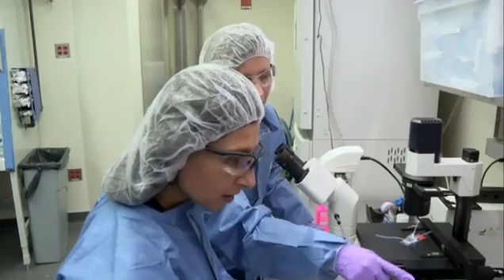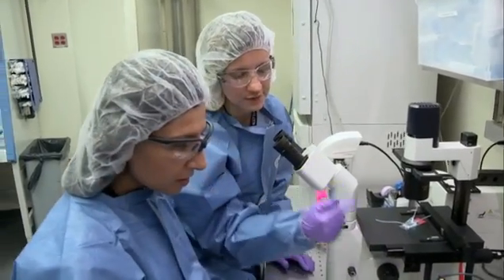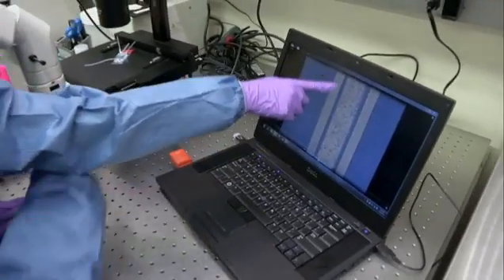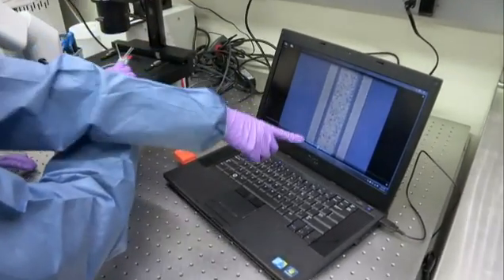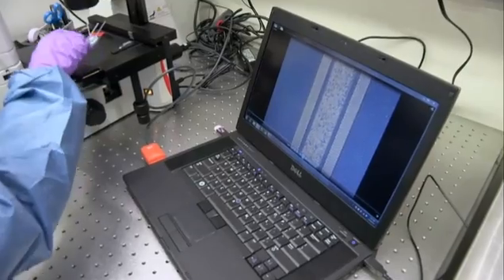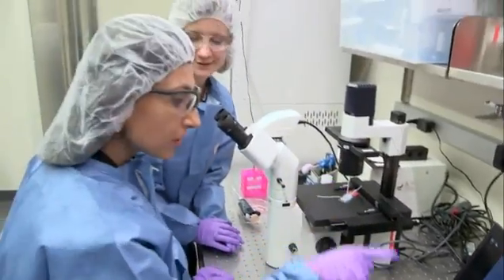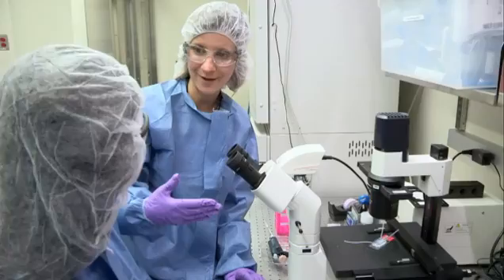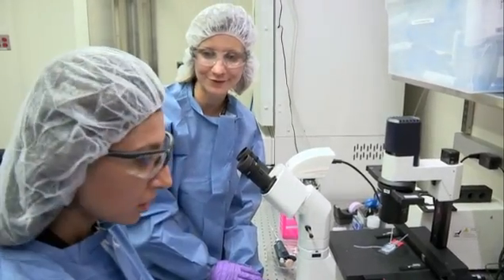And you can see here on the screen, this is a shot of what we could see in the microscope and you can actually see this is the channel. So this is that right now? Yes. So as it's fully loaded with the cells. This is this. What you can see when you place the cells. And we want to look down the microscope to make sure we have a sufficient amount of cells and they're being appropriately loaded on there.